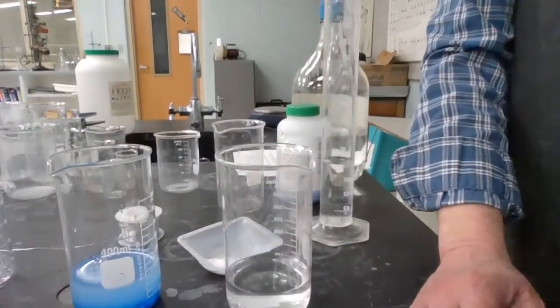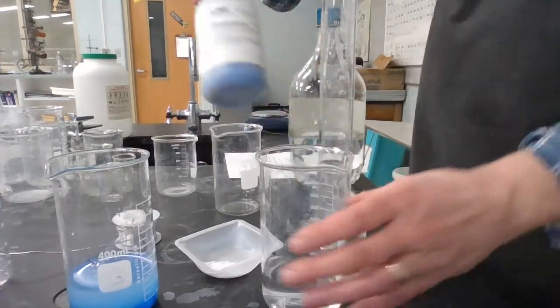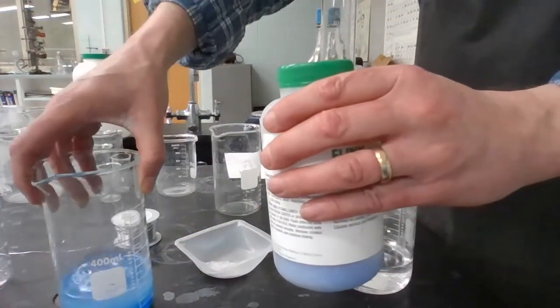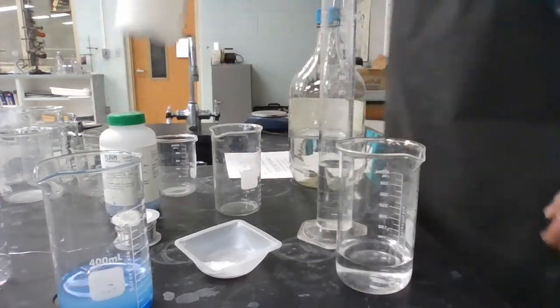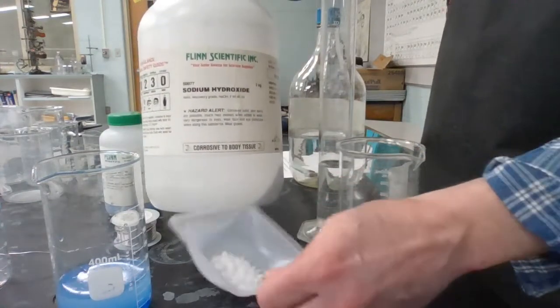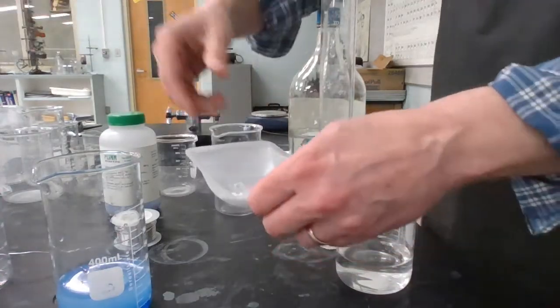All right, so here's our players for our lab today. Let's look down. Some we've seen before. Copper sulfate. This is one. Sodium hydroxide. That's a really strong base. So something not to touch. It's ionic, sodium and hydroxide ions.